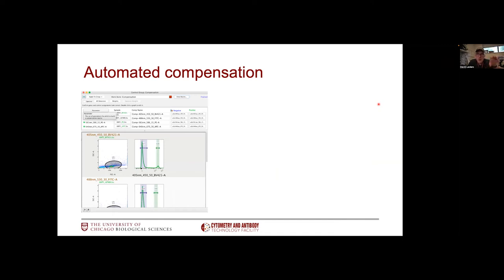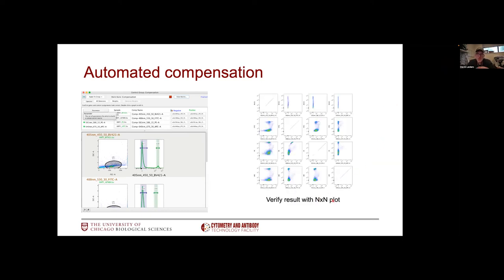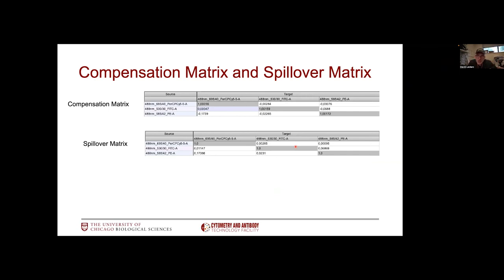The way they work is straightforward. You simply need to load your single stain controls in the software and tell the software what population of cells you need to study, where are the positive and negative fractions, and then the software will calculate all of these overlaps between the different fluorophores automatically and output the matrix that you can use to analyze your data. We recommend double checking the compensation that's been done by the software. You can do that using N-by-N plots, which allows you to look at everything against everybody else.